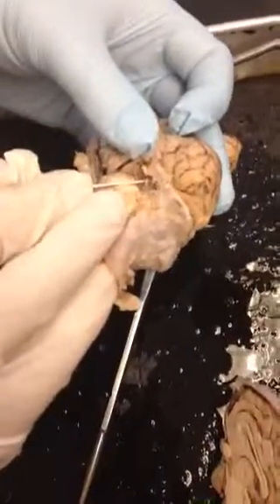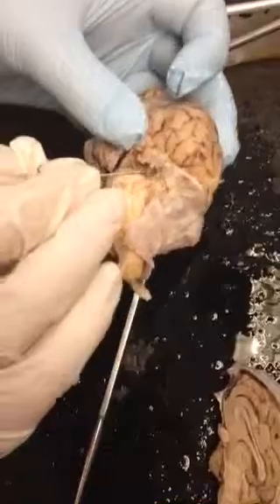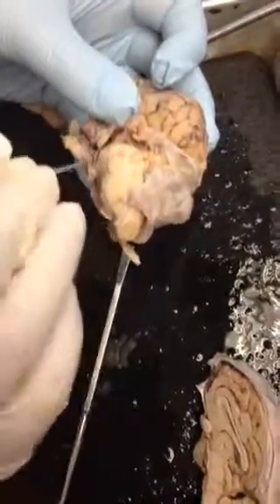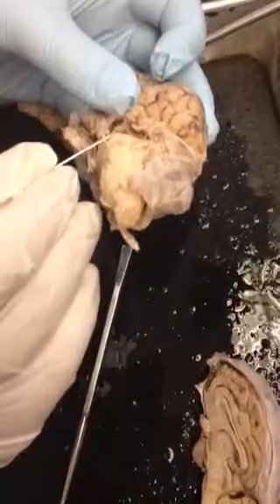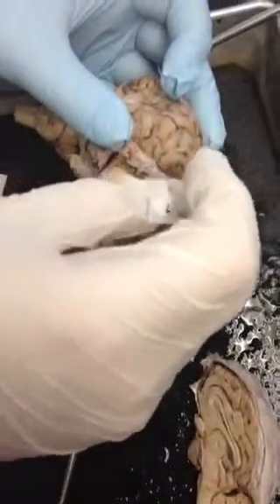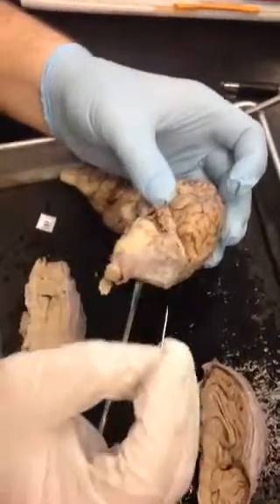Right there. That little white thing looks kind of like a string. It looks kind of like the abducens, just tiny, small, skinny, but it's coming off down here off the side. This is the base of it, and it comes up and kind of wraps around that side here. That's the trochlear. It's right there. Where's the oculomotor again?